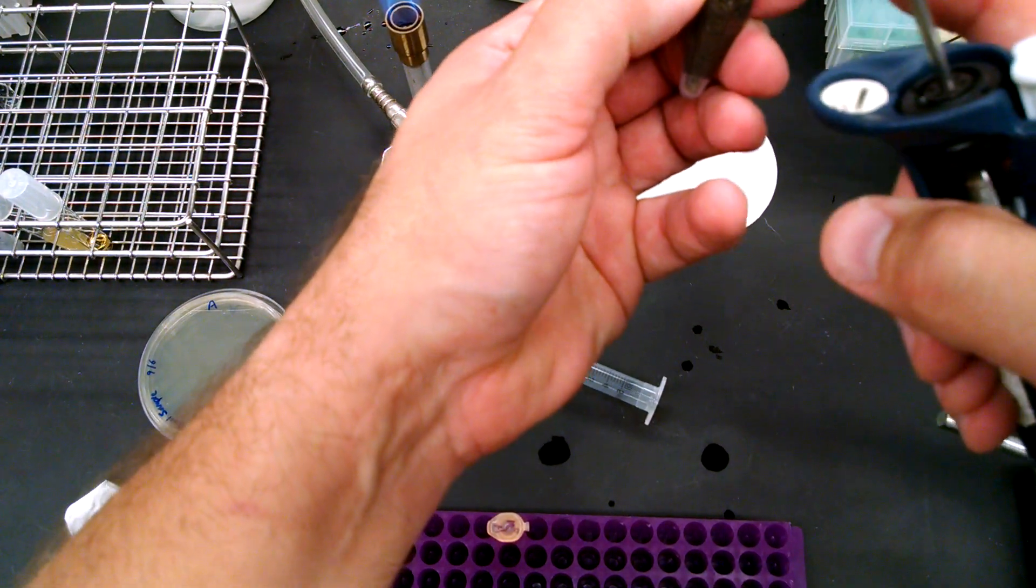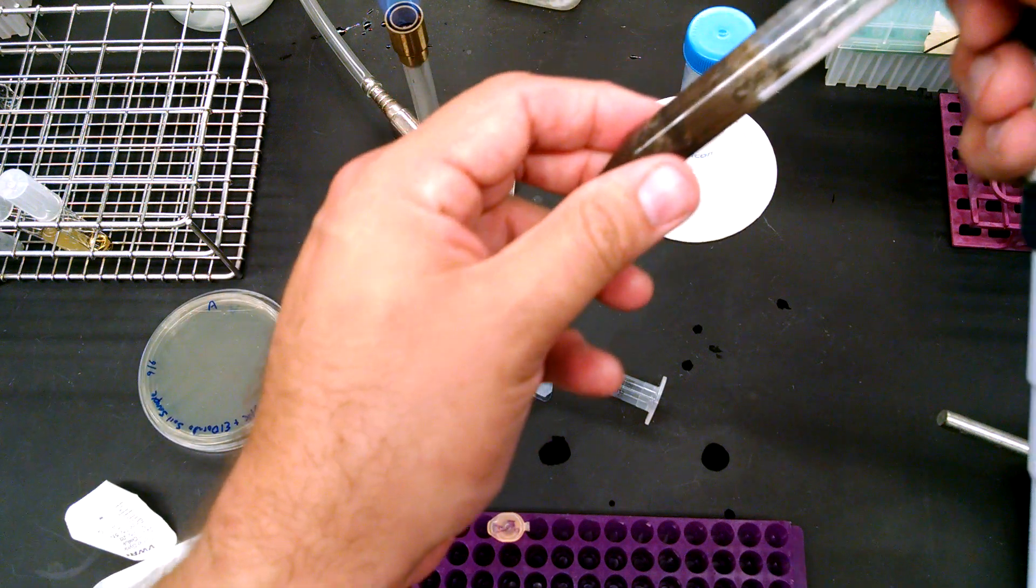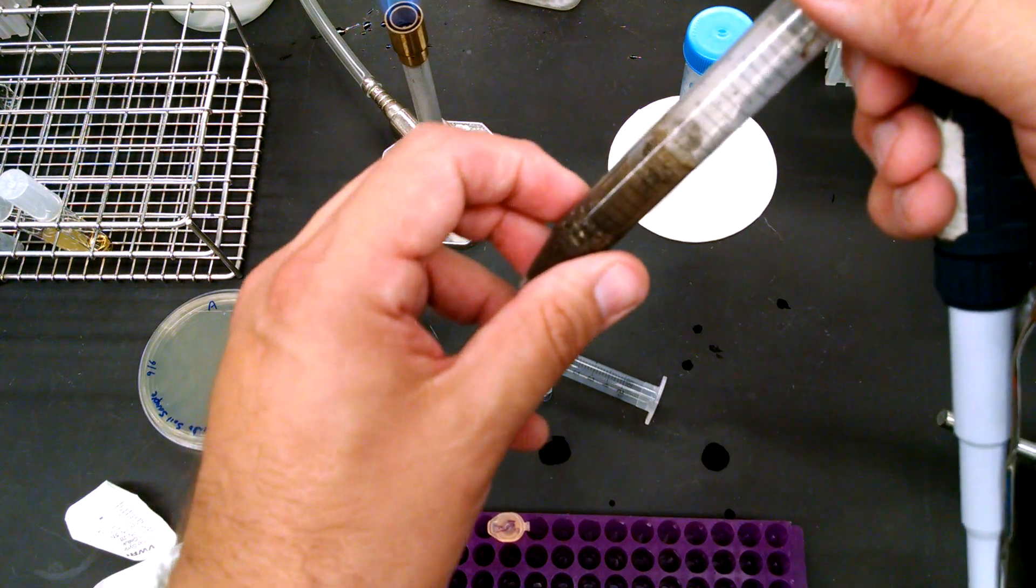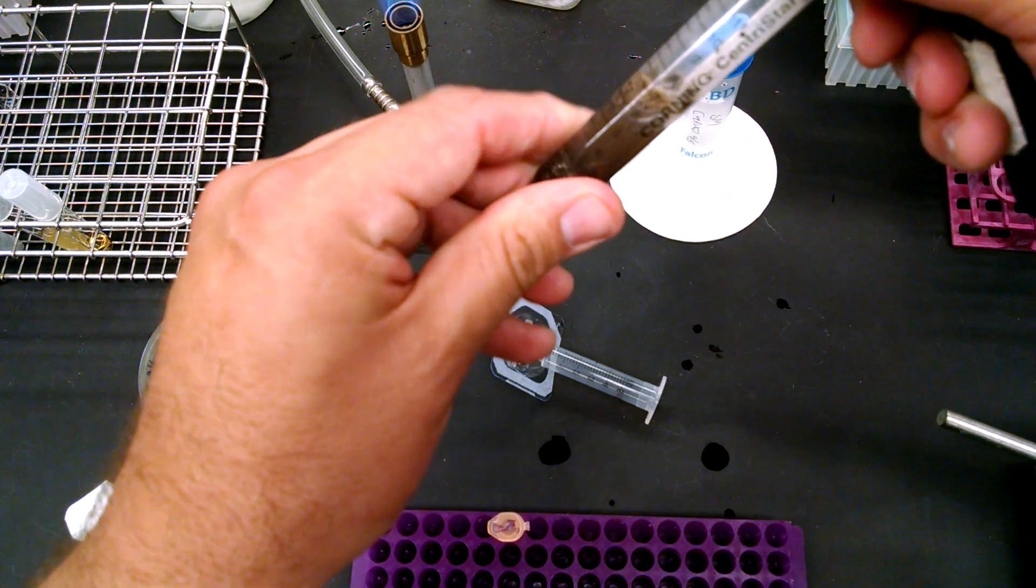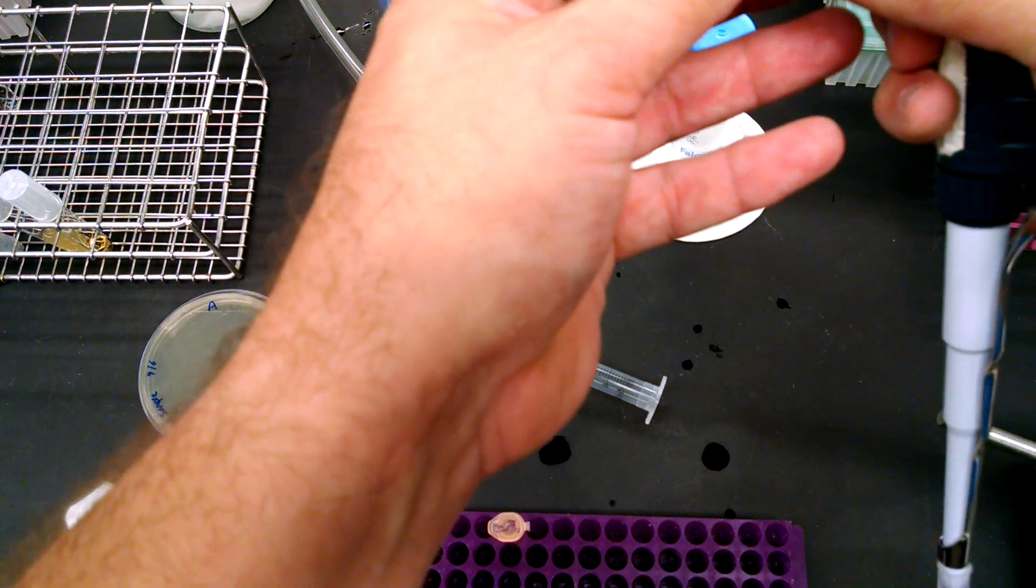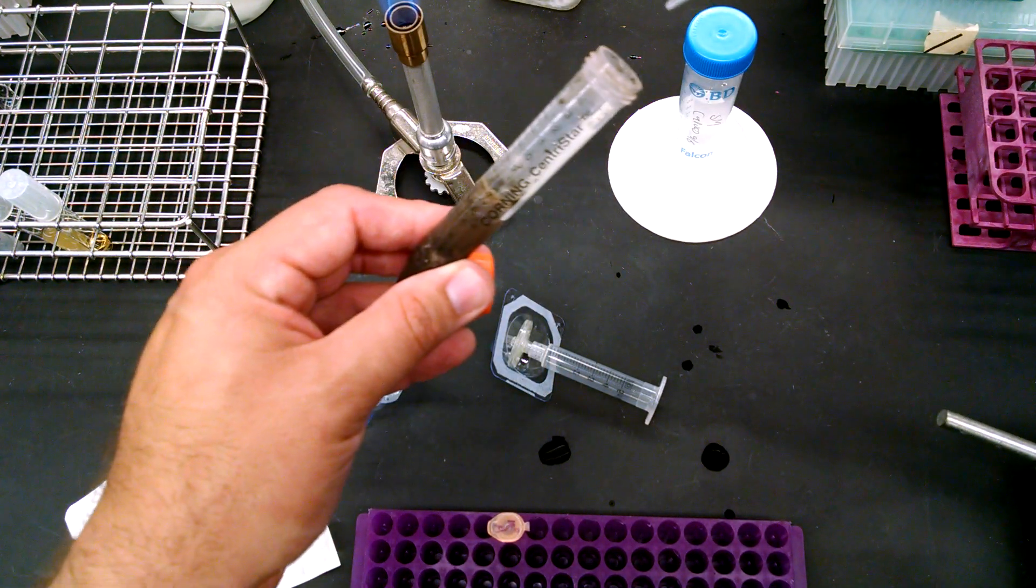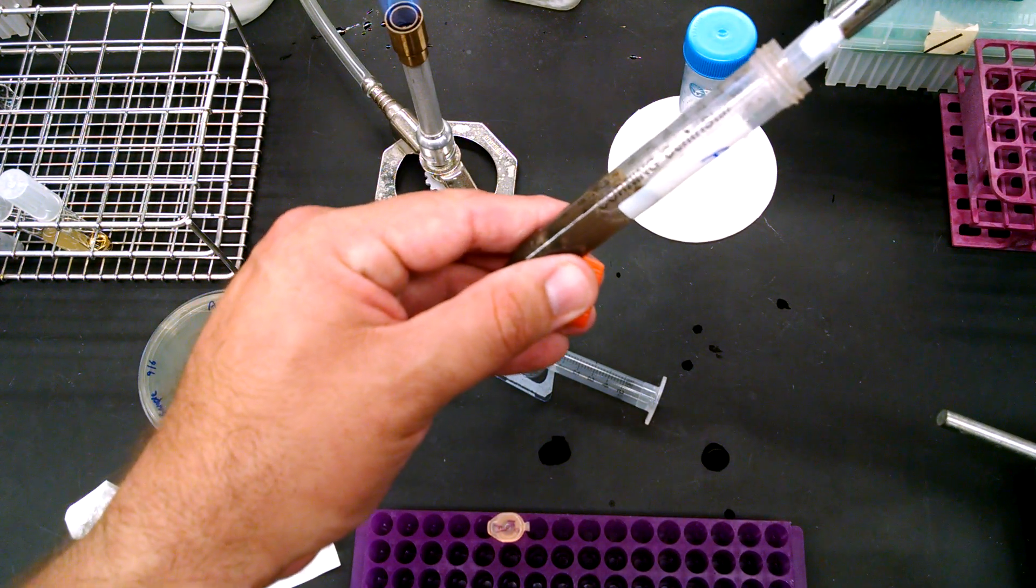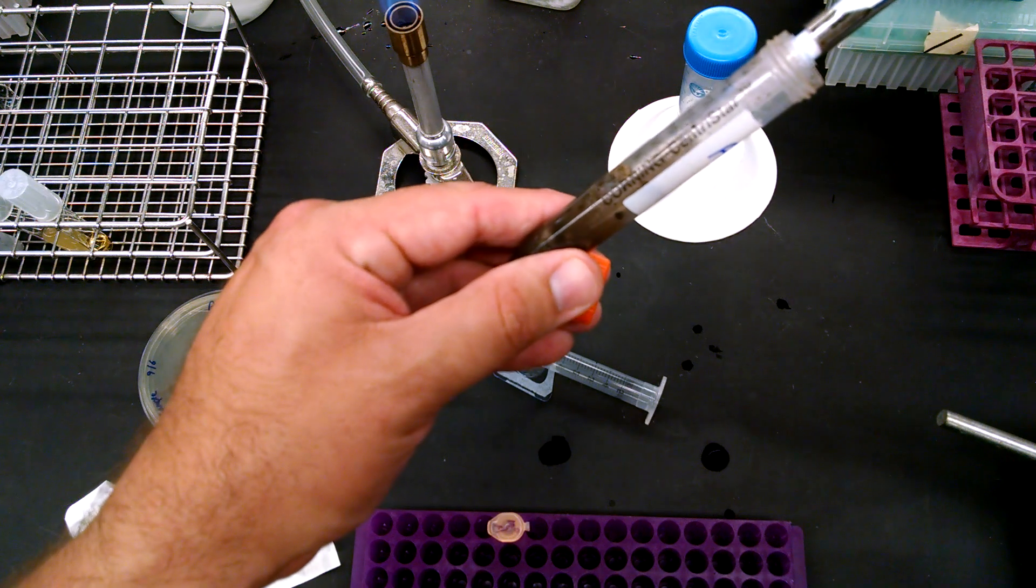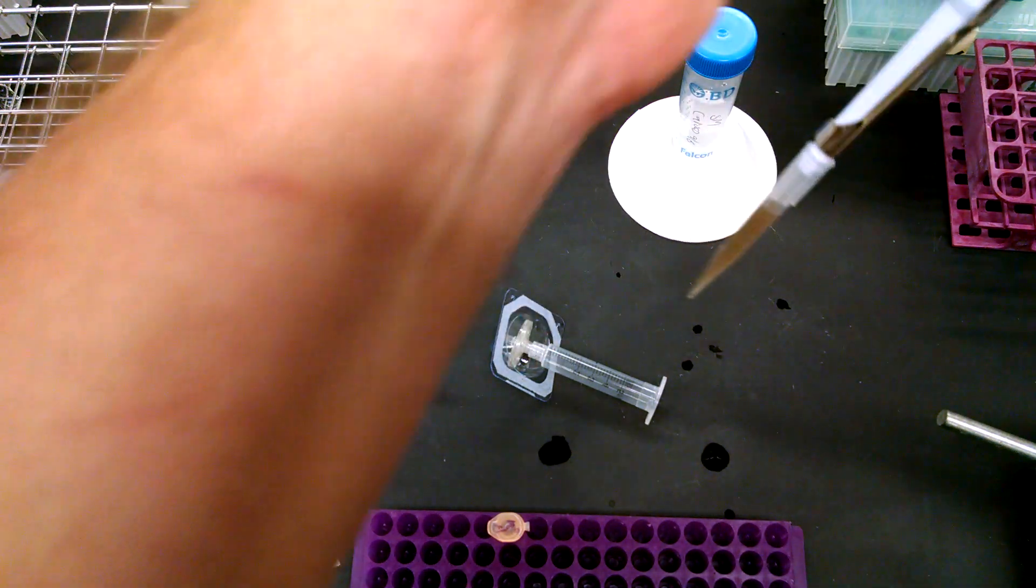And so here's our sample. And you can see there's some crud on top and we probably could have pushed the syringe through this, but let's just be safe. Don't flame these. They're plastic. Anyways, we're about to filter sterilize it anyways. And we'll pipette up a mil or so of this.